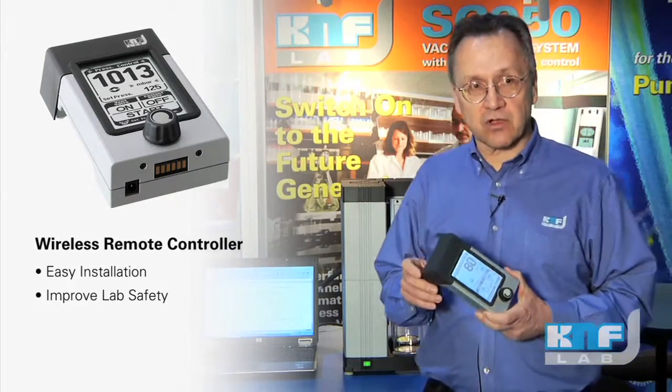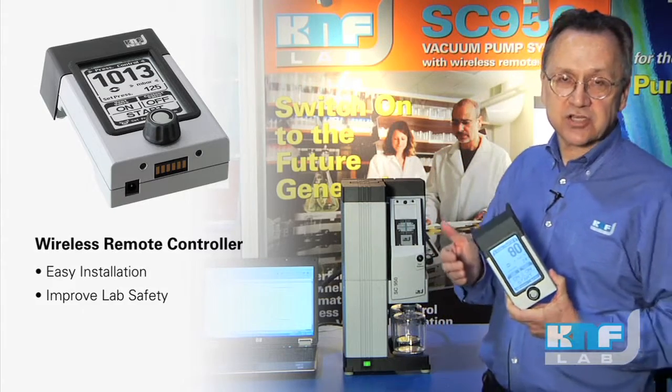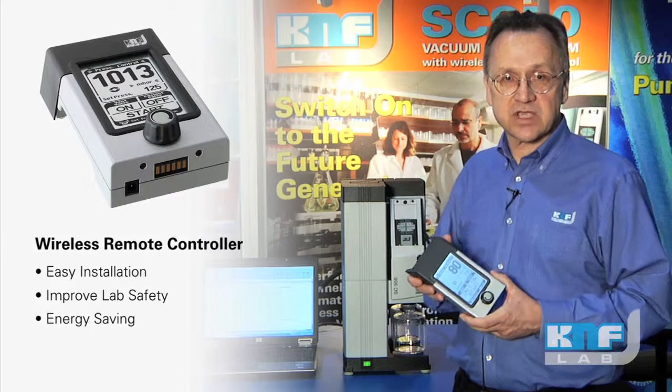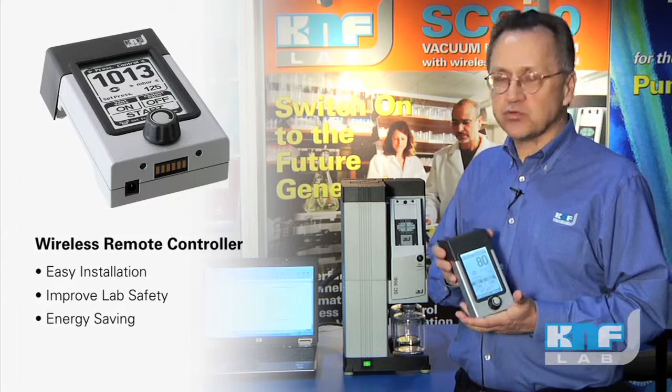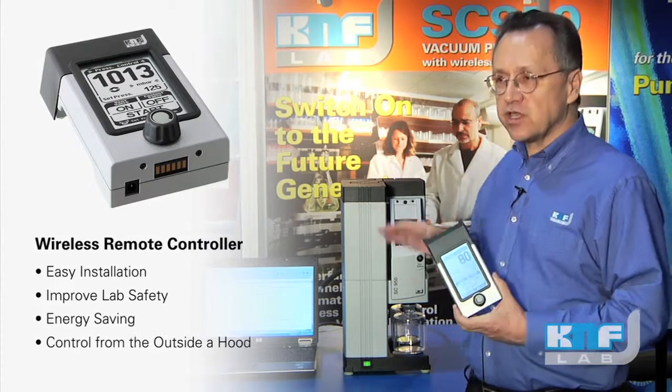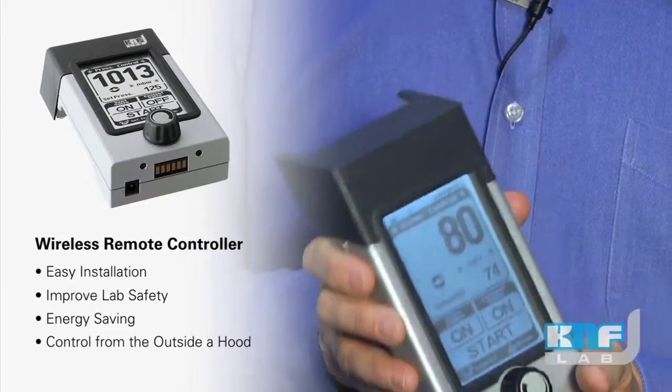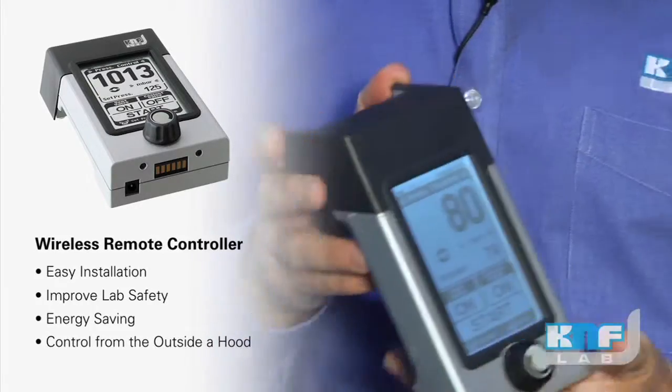One other real benefit of keeping it inside the sash are the energy savings. Numerous studies have shown that open sashes are a huge waste of energy for the laboratory. Here, keep the system inside with no tether, no cord, and you can do all your operations via the controller.